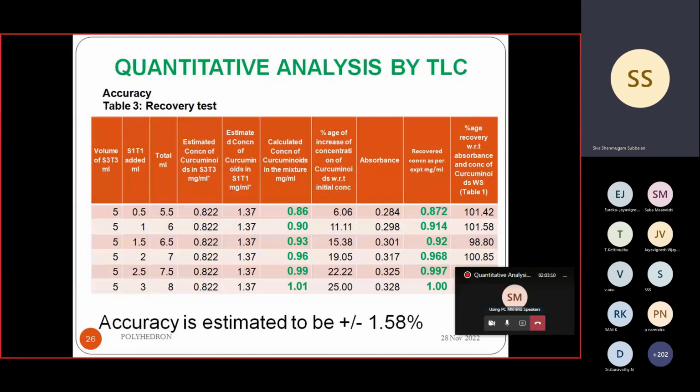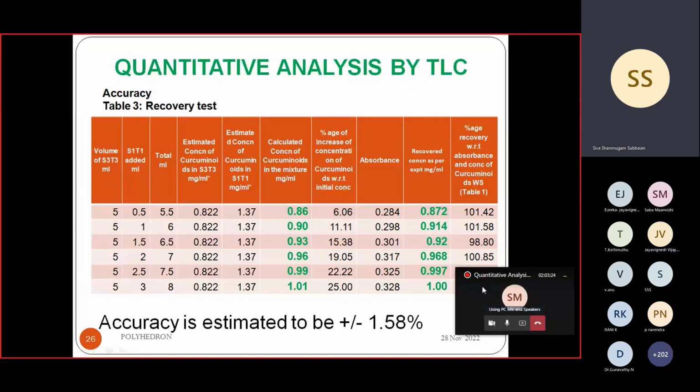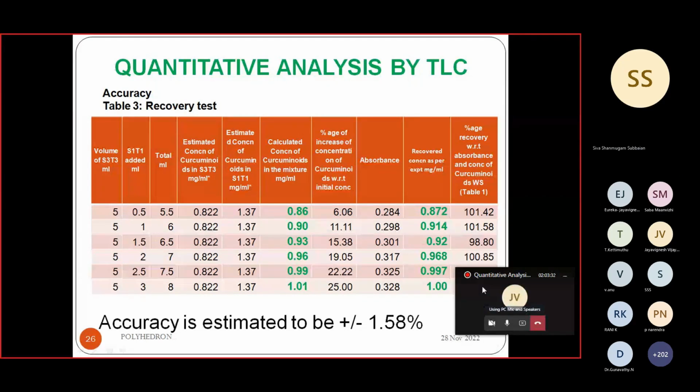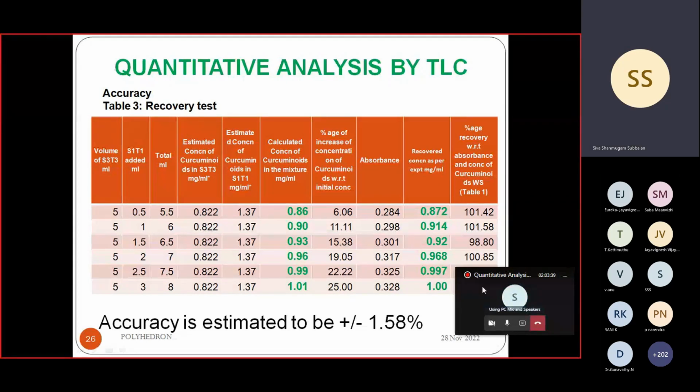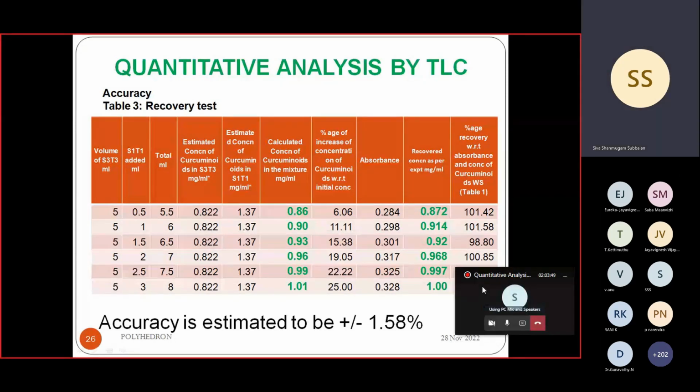Okay, somebody has raised their hands, it seems. Can you please tell me what it is, Vignesh or Dr. Manveli? I think Mr. Sarangan and Mr. Pinto have raised their hands. So this is Sarangan. Tell me, sir. Sir, I had actually raised the hand for when you were explaining the thin layer chromatography experimentation pictures. So when you spot the sheet, doctor, how do we ensure that all of the spots are exactly the same quantity of solution? We are using a micro syringe of 10 microliter.